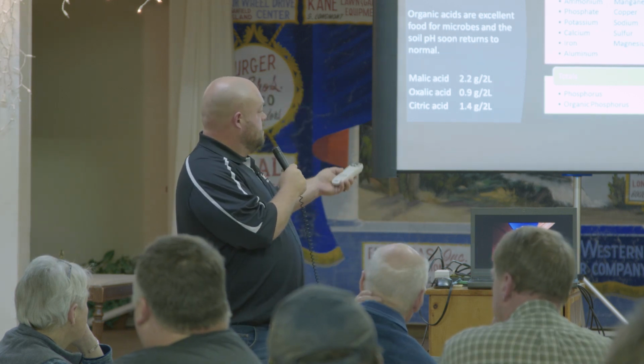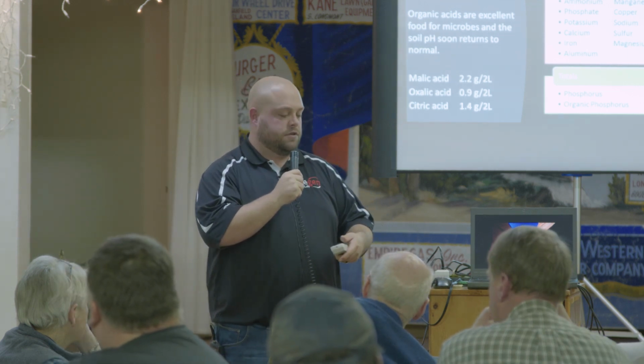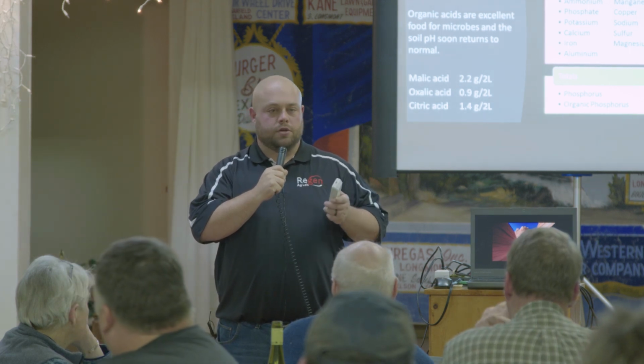So with the Haney test, we're going to measure not only phosphate, which is the plant-available form of phosphorus, we're going to also measure all of the extractable phosphorus and subtract the phosphate, and what we have left over is what's called organic phosphorus. It's soluble, the plants can see it, it's part of the system, they just can't use it because it's not in the right form. Who transforms nutrients into the right form? Microbes. So now we just measured the phosphorus availability to microbes.